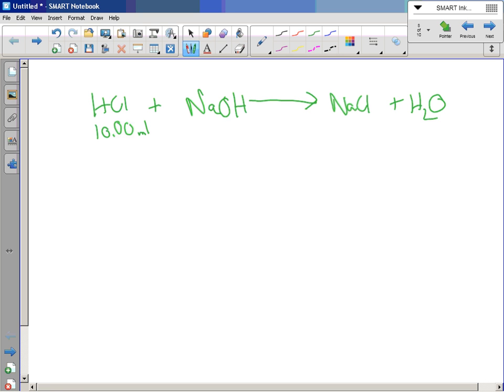It's very accurate. This guy as well, what was our average? 9.80 milliliters. We know the concentration of one of the solutions. I told you it's 0.50, but for the sake of significant digits, let's say that we had standardized it and we know it exactly to 3 significant digits, moles per liter.